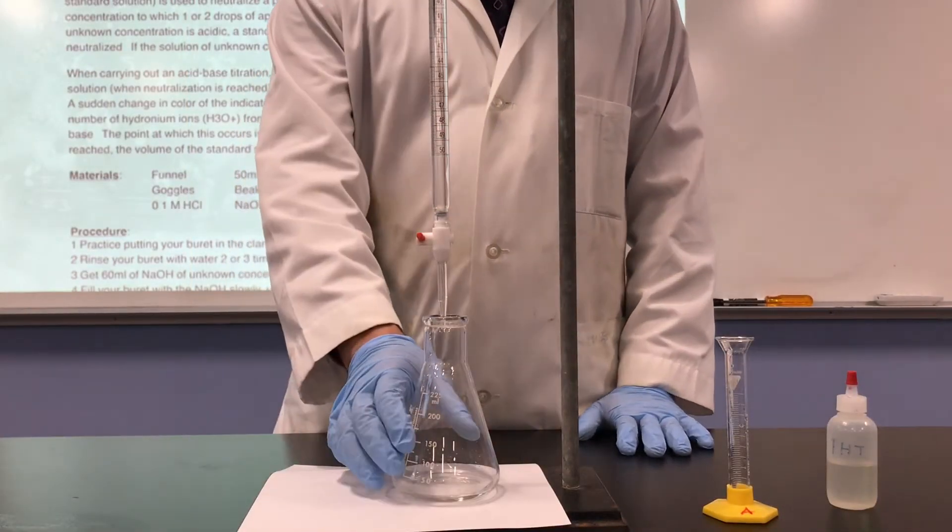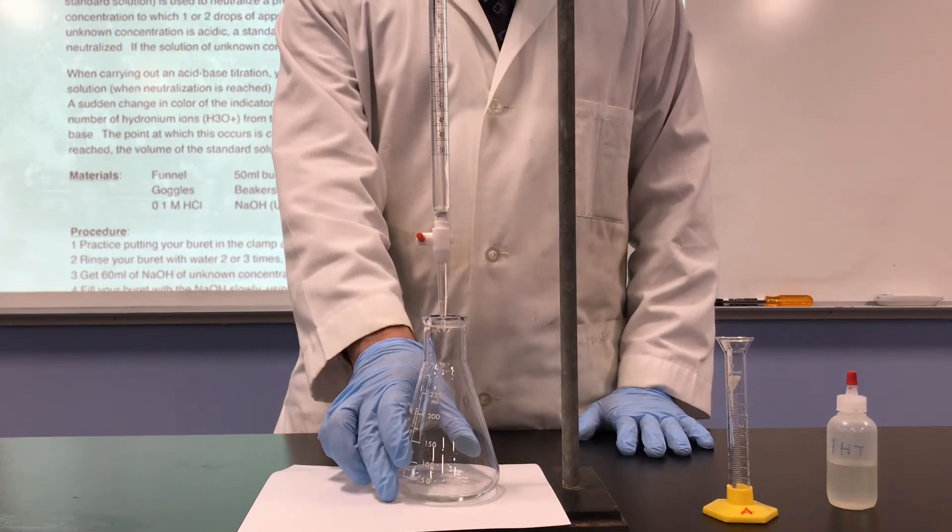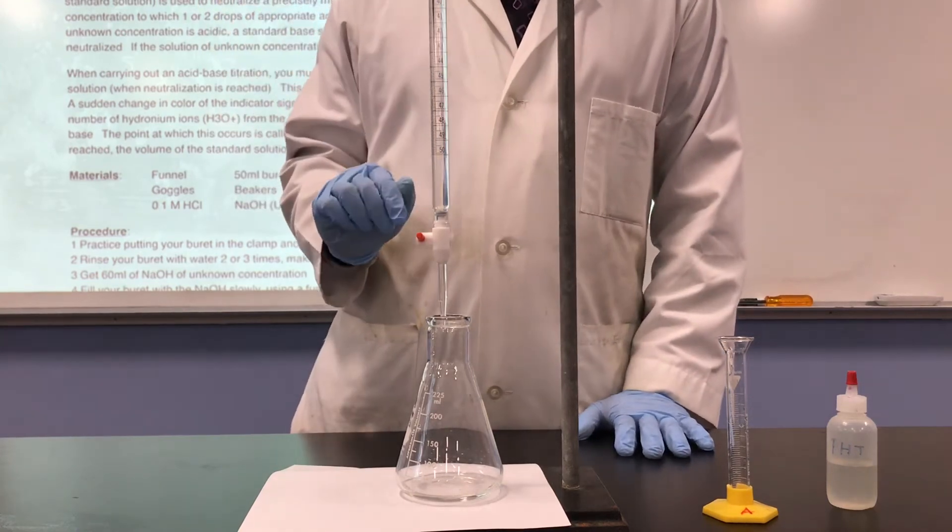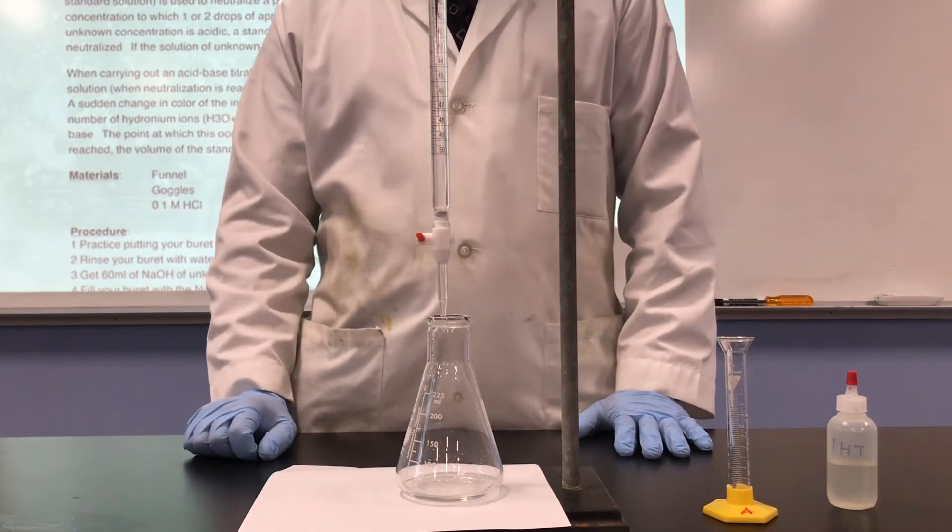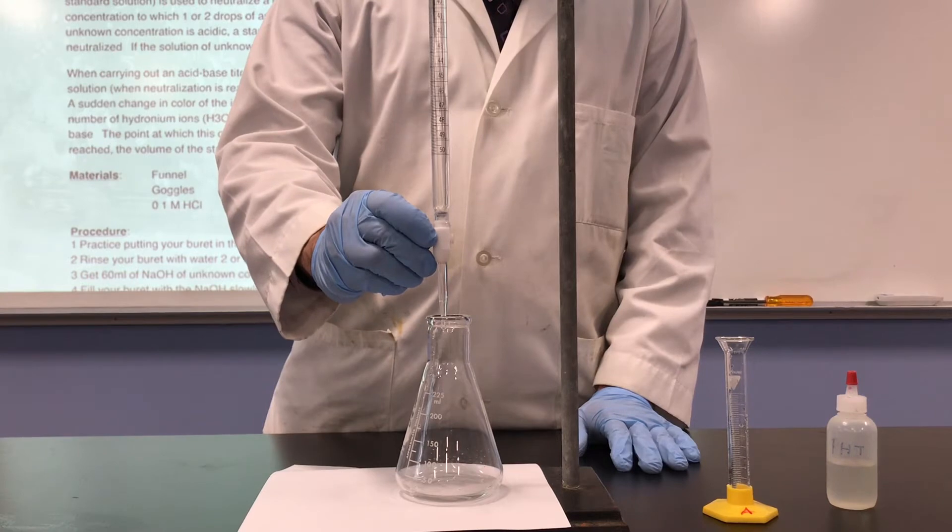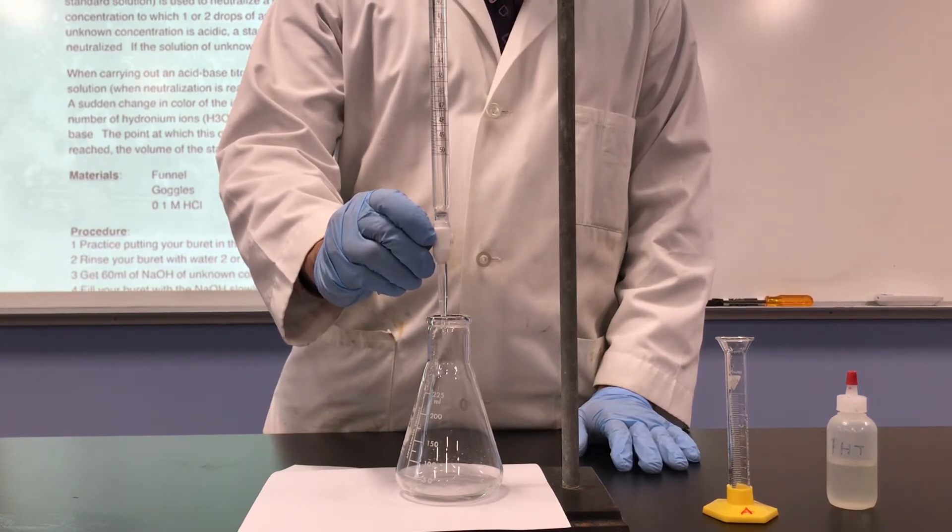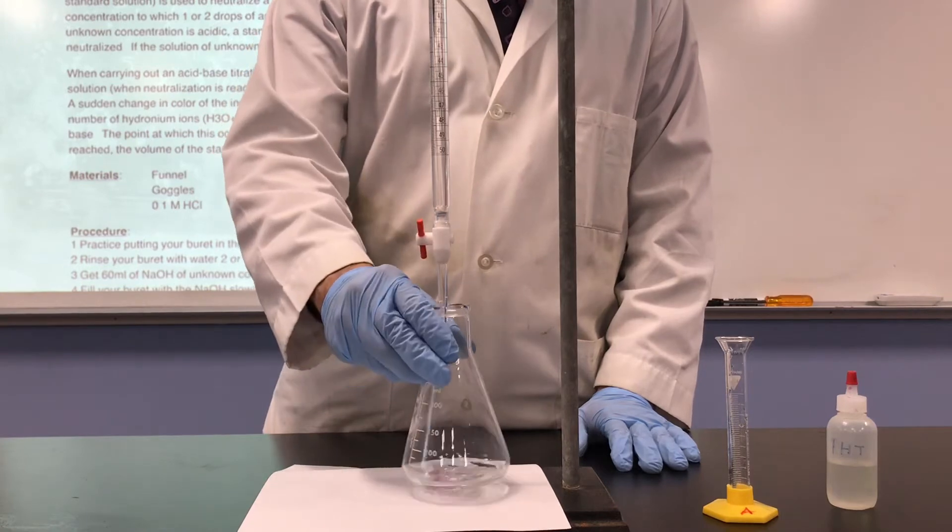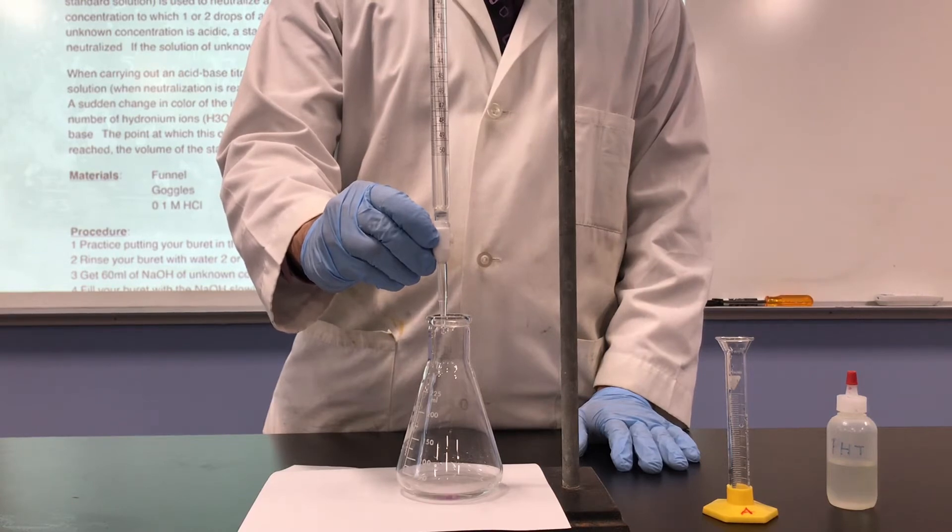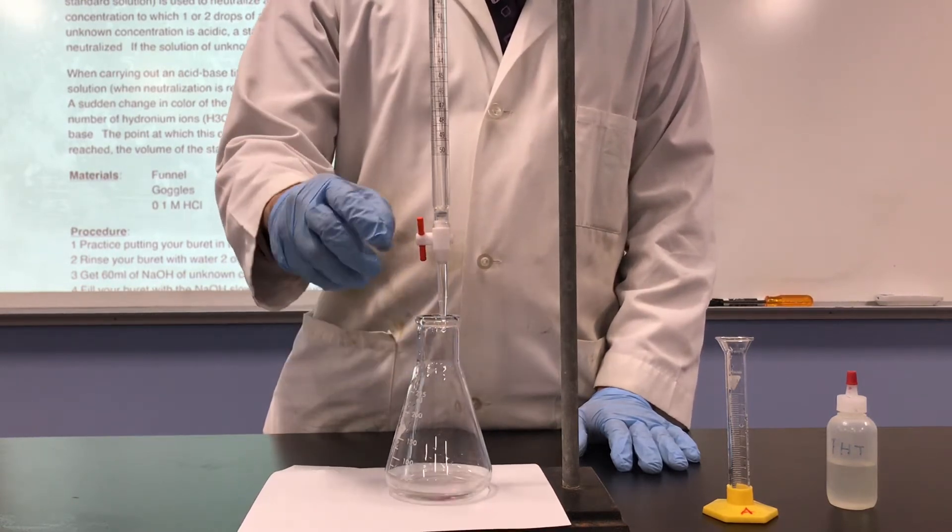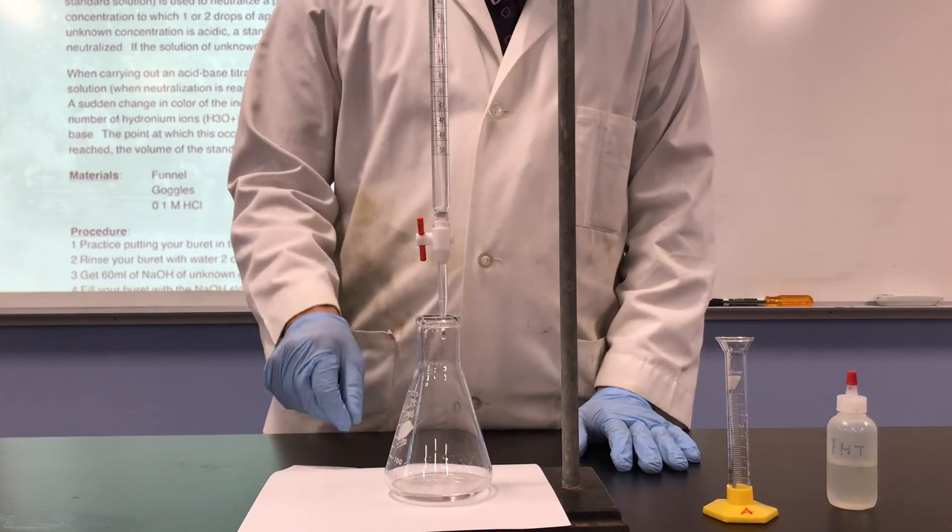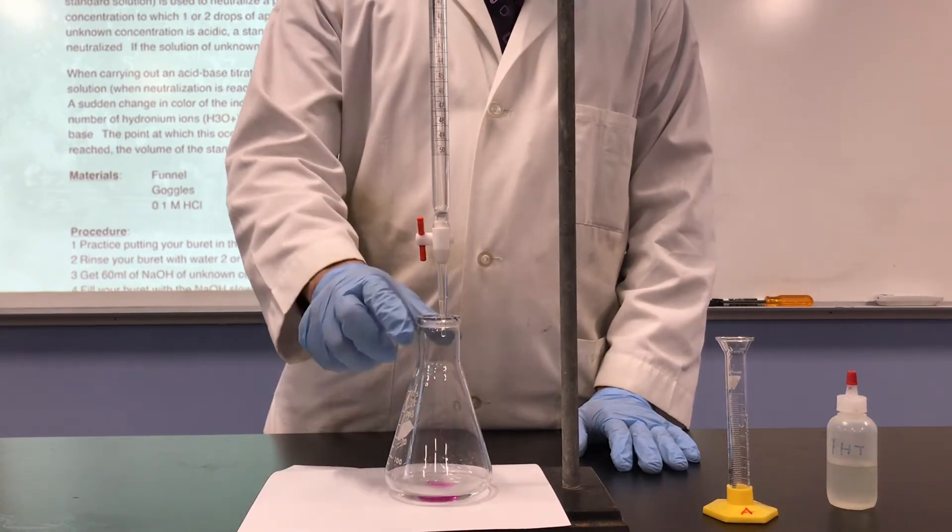So now that we carefully added 10 milliliters of hydrochloric acid and phenolphthalein into the flask, and we have our burette filled with 50 milliliters of 0.25 molar NaOH, now we can perform our titration. We're going to start off slowly by turning the stopcock to the parallel position and let the base titrate into the flask.